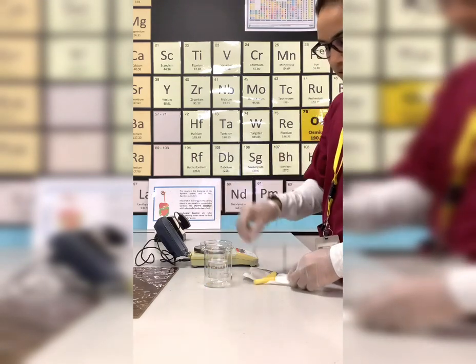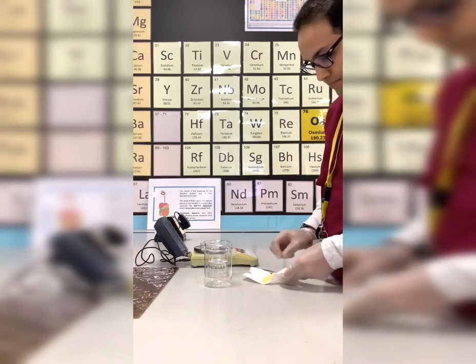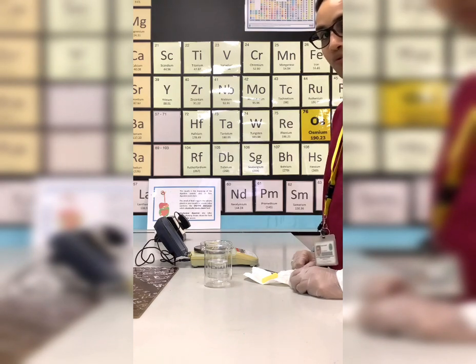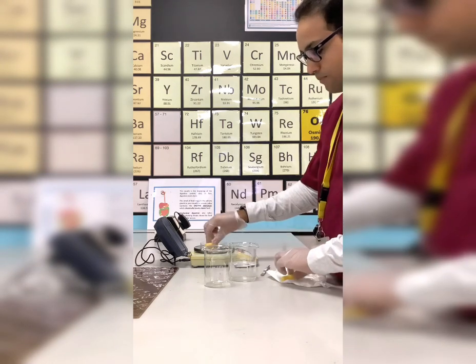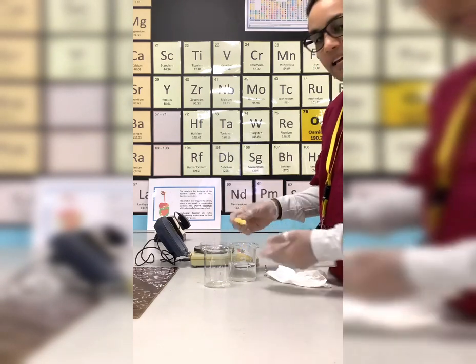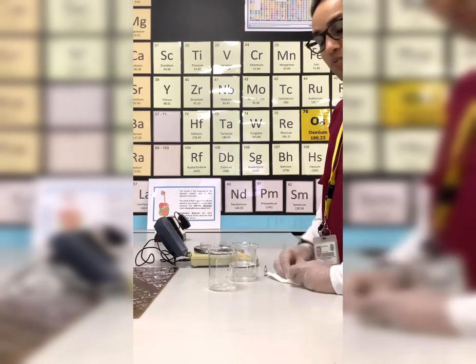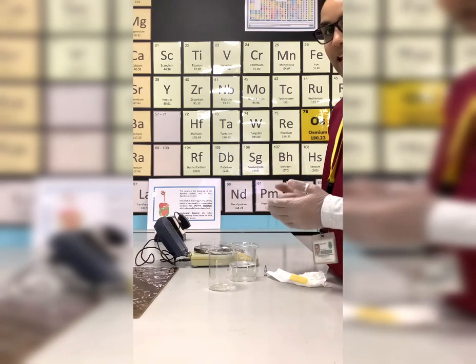Let us check the mass for the cylinder which was kept without any water, just in an empty beaker. The mass has decreased to 5.1. So there is a difference of 0.25 grams, which means that the mass decreased. So when we put any type of vegetable or any substance inside distilled water, it absorbs the water. So the water diffuses in, whereas in an empty beaker, the water diffused out, or it lost, it got dried, it got dehydrated. So this was the experiment for diffusion, which is a basic key stage 3 diffusion to explain how diffusion takes place in and out of a substance.